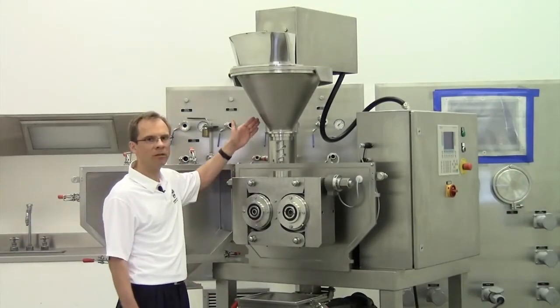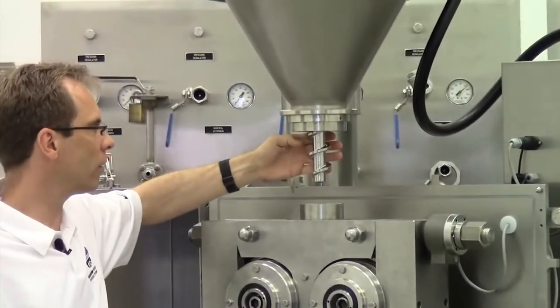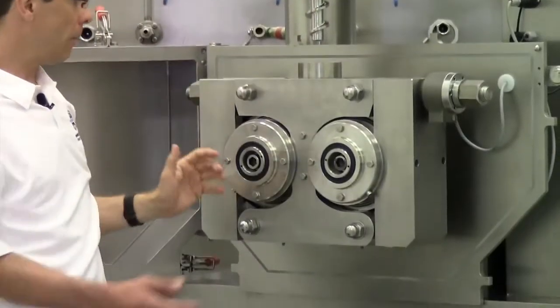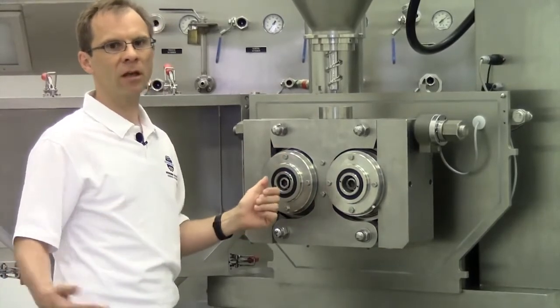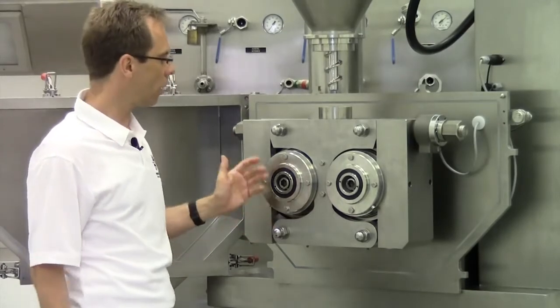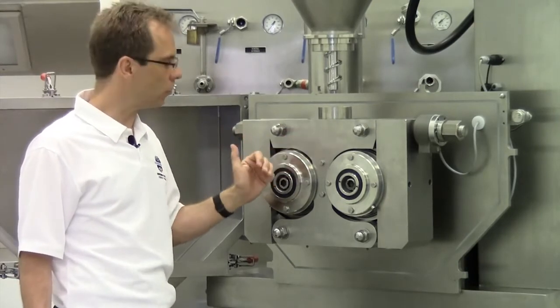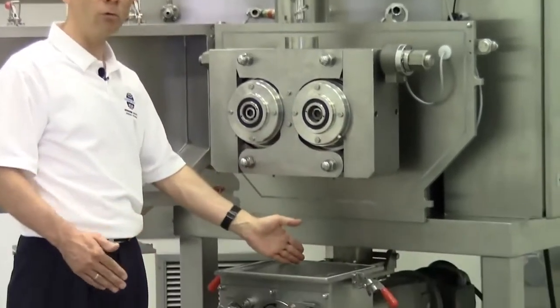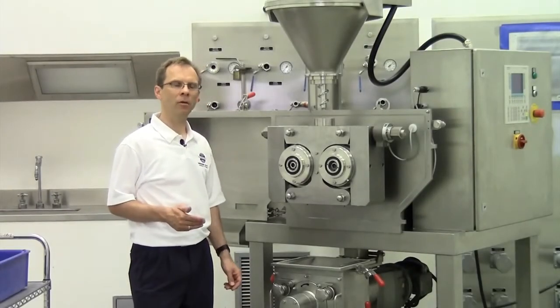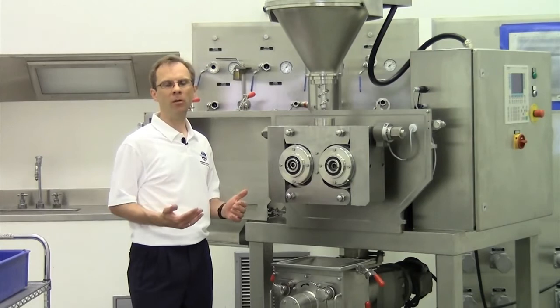When we do compaction, we feed in powder. The powder is transferred and conveyed with a feeding auger to the rolls. Between the rolls, material will be pressed very hard. The maximum pressing force of this machine is 30,000 pounds, which is rather high for such a small machine. With these high pressing forces we press the powder so close together that we get a uniform flake, which comes out of the rolls and can be crushed in the flake crusher. The biggest advantage of this Pharma Pactor is the combination of very high pressing forces, robust design, and also good cleanability and maintenance.